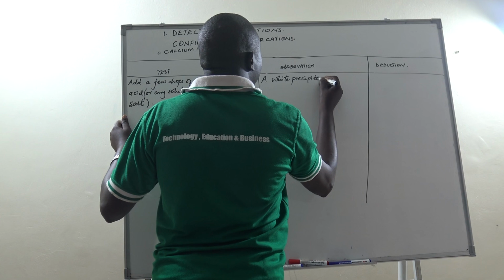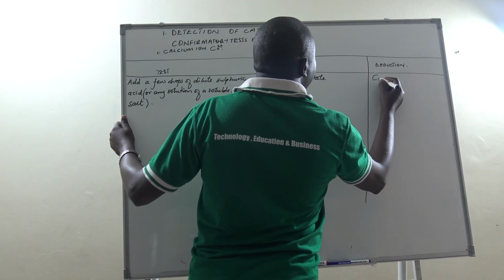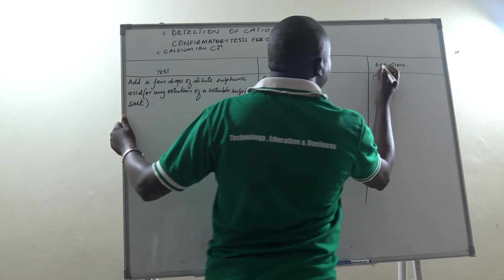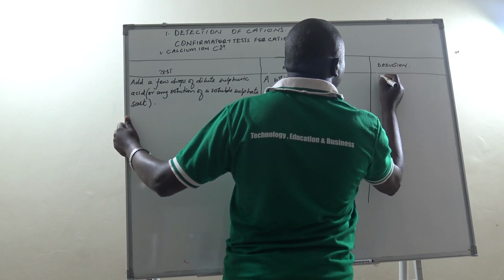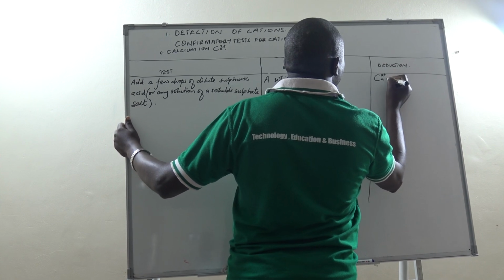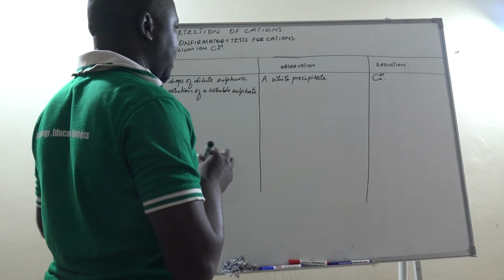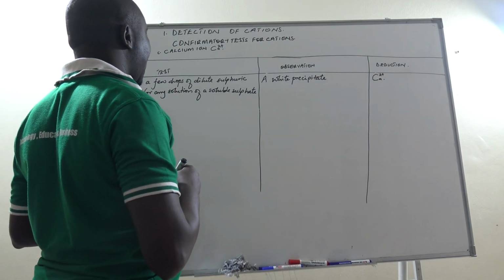So our deduction will be calcium ion in this case.